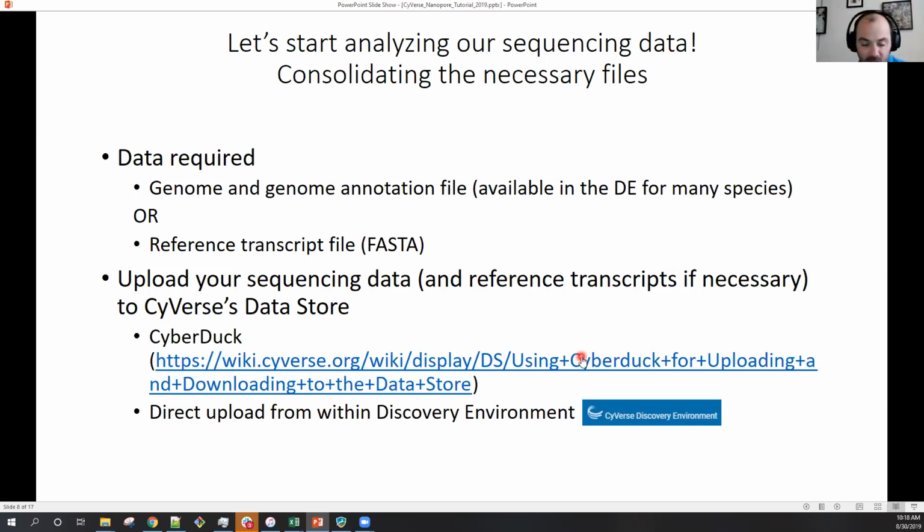And if you're just performing mRNA sequencing, you can use Guppy to do base calling on a standard PC, Mac, or Linux platform, and it probably won't take a super long time. If you're trying to do Guppy base calling on genome sequences, then you should probably seek out some kind of GPU platform, because otherwise it's going to take you weeks to base call your data.